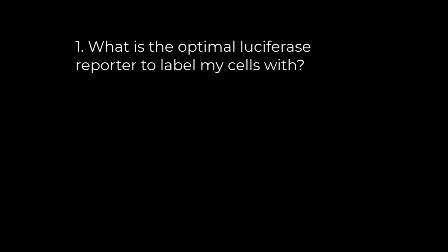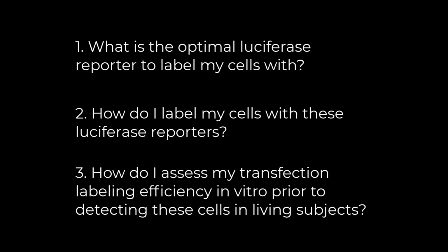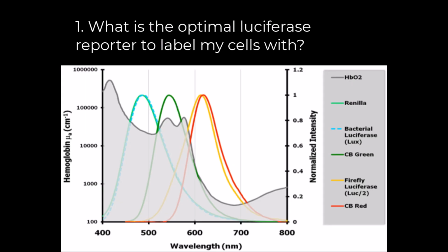Some key questions that will be answered in the video are: 1. What is an optimal luciferase reporter to label my cells with? 2. How do I label my cells with these luciferase reporters? And finally, 3. How do I assess my transfection labeling efficiency in vitro prior to detecting these cells in living subjects? So let's address the first question.